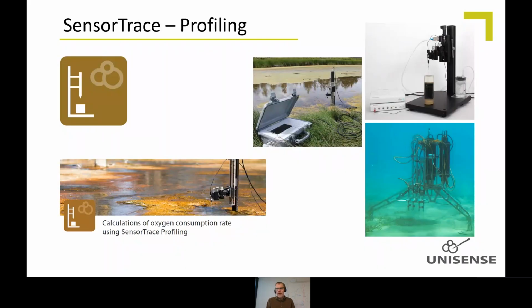So about profiling. I already mentioned we have different ways of doing profiling. This is the laboratory setup. We have the field microprofiling system, which is all shown here, and we have the in situ mini profiler, which can be taken to the seafloor, all the way down to 6 kilometers water depth. All profiles measured by these can be analyzed by the software.